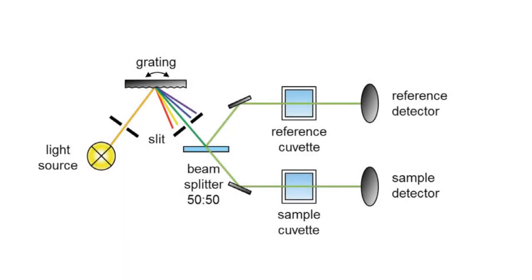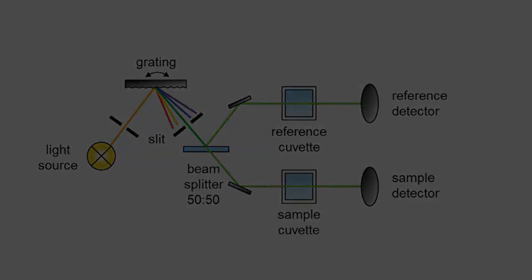The reference sample is also called the blank solution, having all the diluent present in the test sample except the drug or substance which is to be analyzed. And why do we use this blank? Well, the answer is to negate or cancel out the absorbance value of the diluents as well as the absorbance value of the cuvette material by scanning or taring it to auto zero.